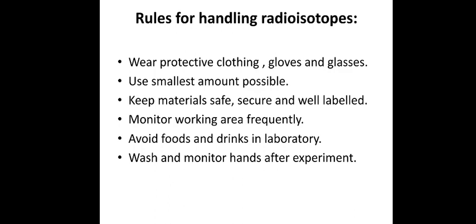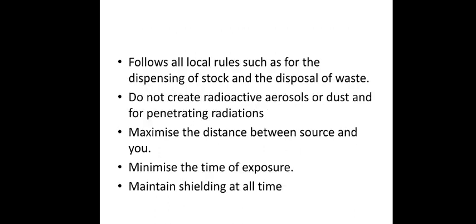Avoid foods and drinks in the laboratory, and wash and monitor hands after the experiment. Always follow the local rules, such as for the dispensing of stock or disposal of waste. Do not create radioactive aerosols or dust, because they are much more dangerous. Maximize the distance between the source and you. Minimize the time of exposure, and maintain shielding at all times. The three principles of ALARA.